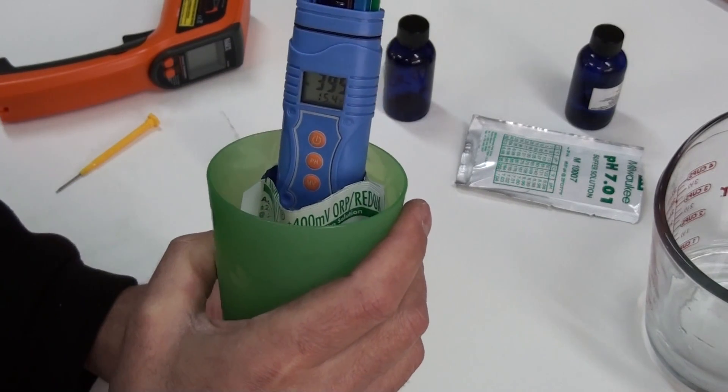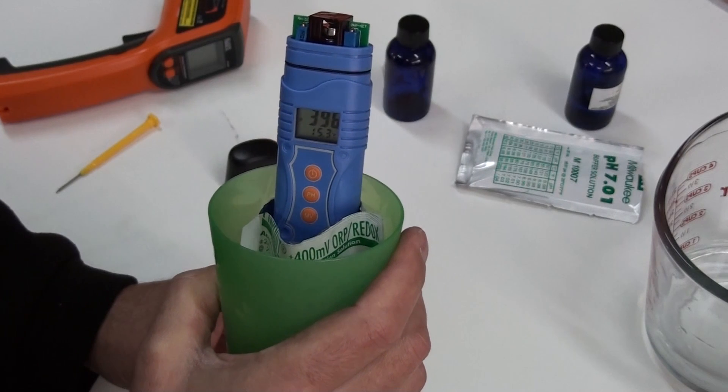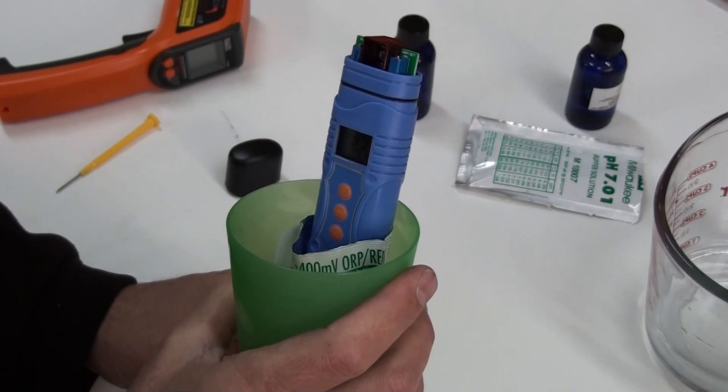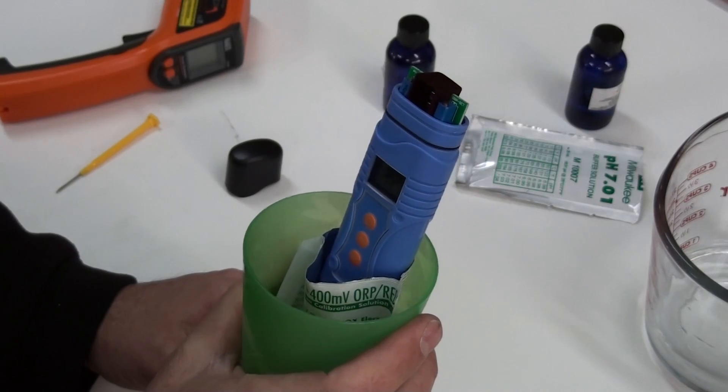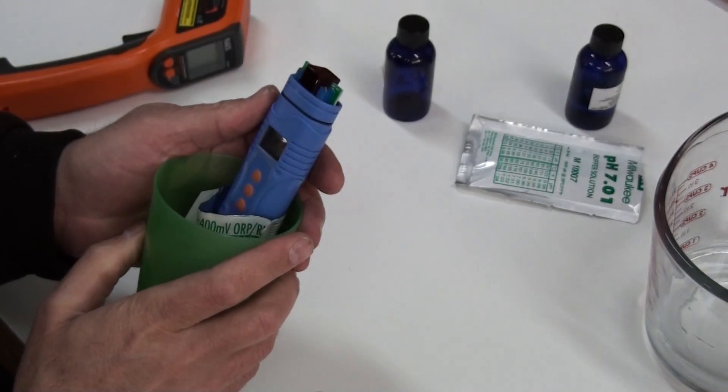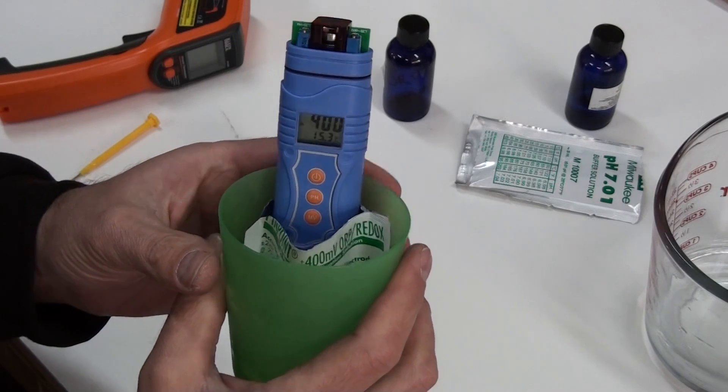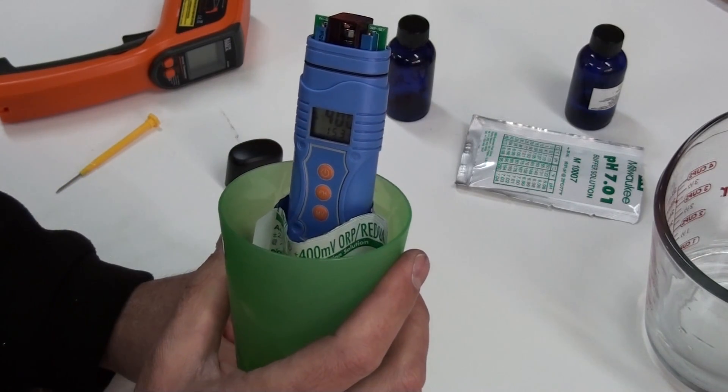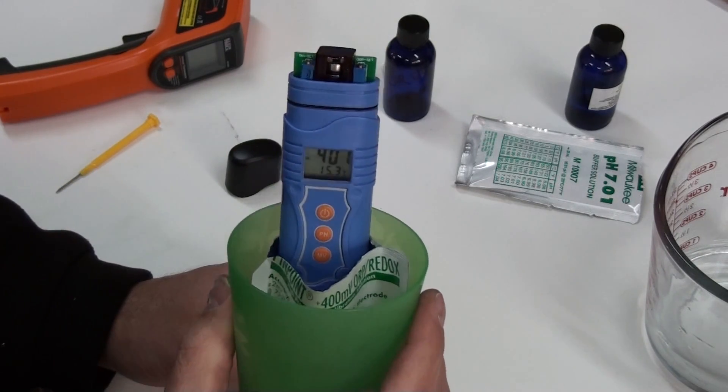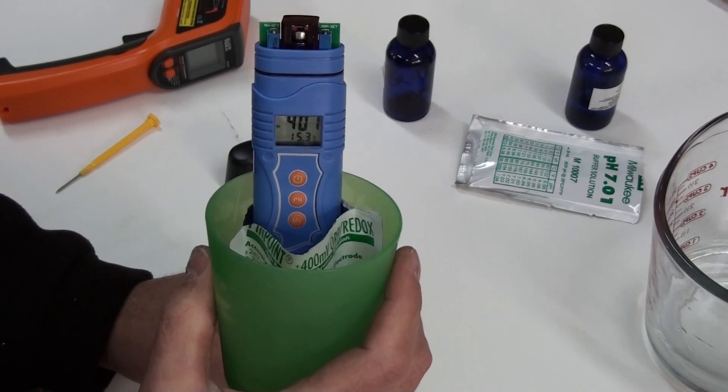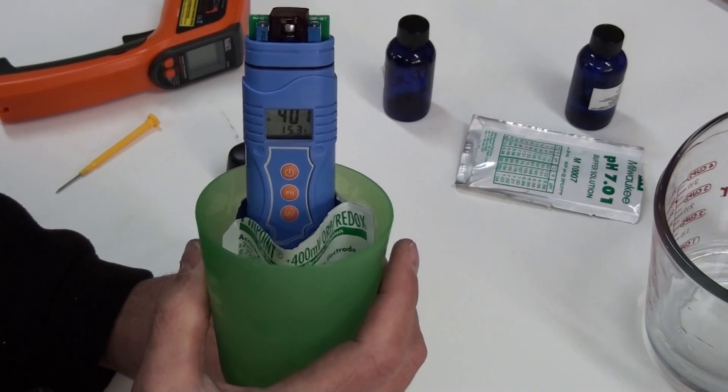We've got 4 negative. Oh, I'm sorry. It's positive 400 millivolt. So we're at positive 400 right now. We'll let it settle down.